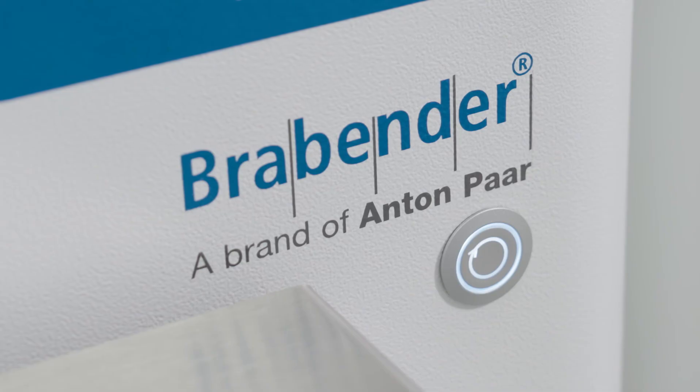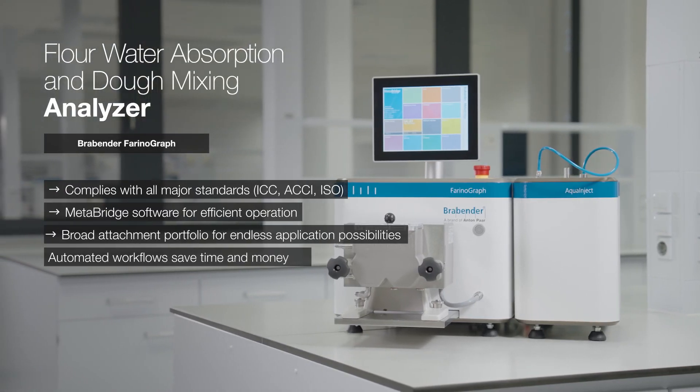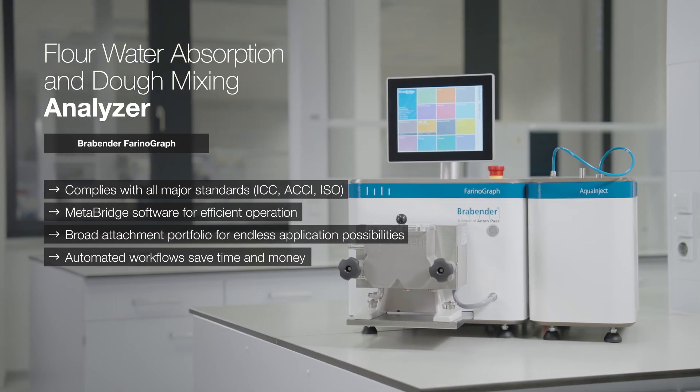Farinograph is designed to put you at the forefront of baking, refine and shorten your workflows, eliminate errors, and win you precious time.